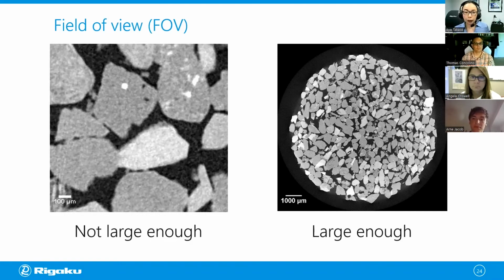we cannot quite say the larger, the better, because when your field of view is really large and the resolution stays high, then you have to worry about the file size. So what this means is we kind of have to balance the field of view, the voxel resolution, and SNR, signal to noise ratio. And the reality is they're in a trade-off relationship. So you have to pick 2 out of 3 to focus on.